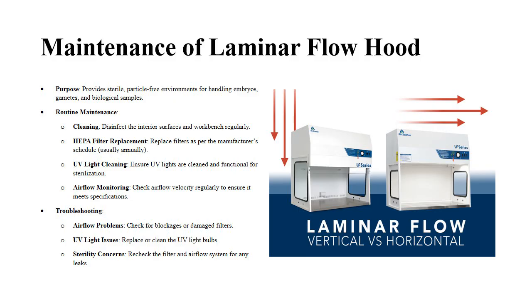HEPA filter replacement: HEPA filters should be replaced at regular intervals, typically annually or as recommended by the manufacturer, to maintain proper airflow and contamination prevention.